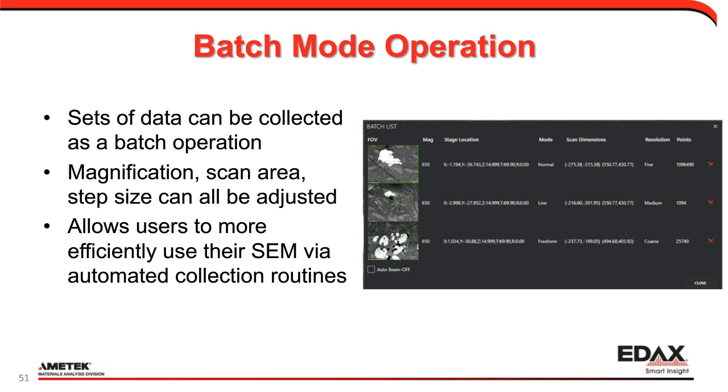That allows users to use their SEM more efficiently. You can set it up and let it run overnight, or set it up, let it run, and come back later in the day, and multiple scans will be collected from multiple regions or multiple samples.